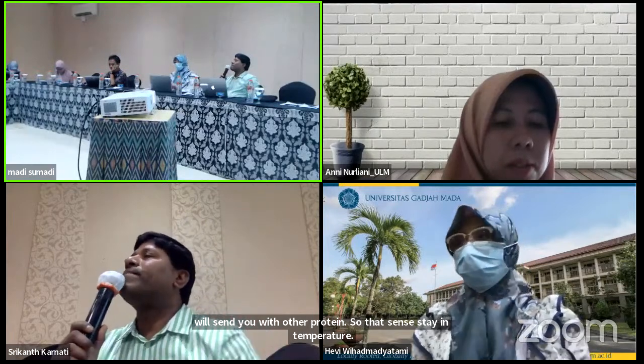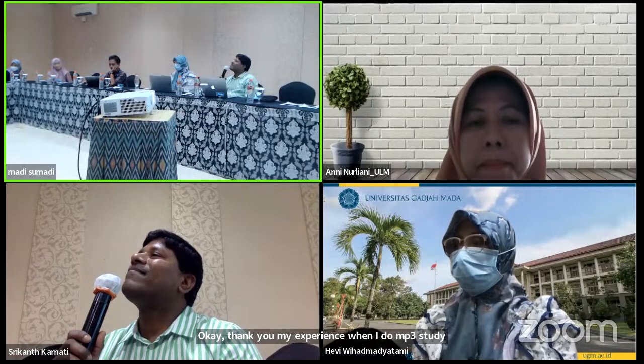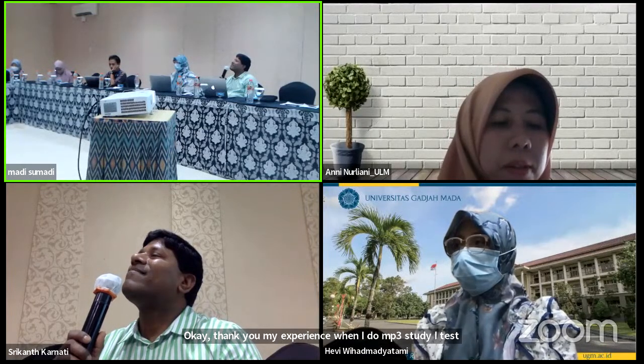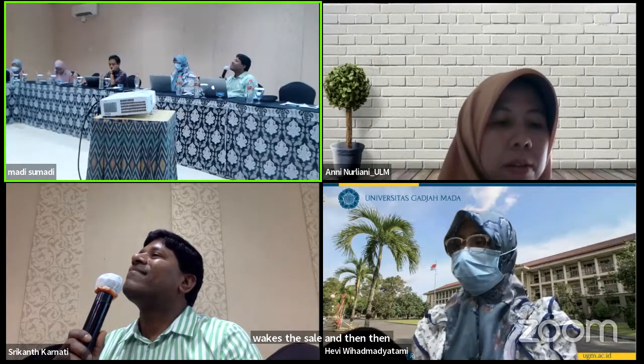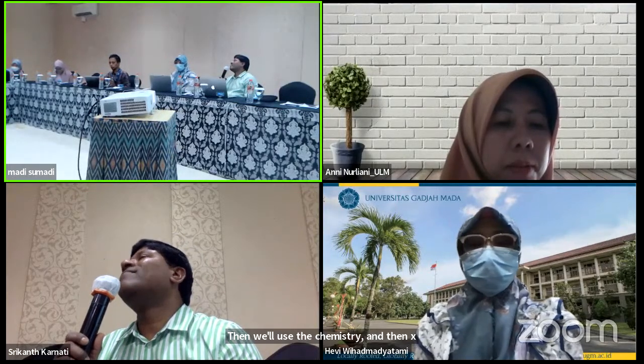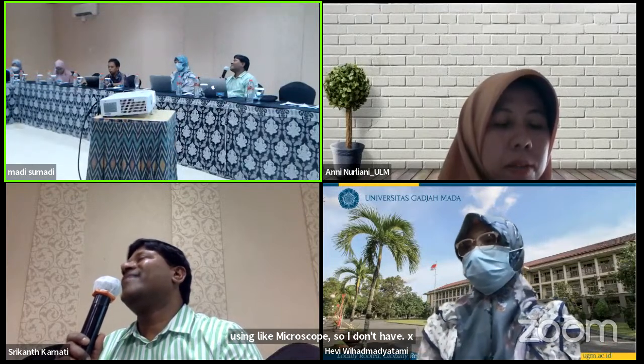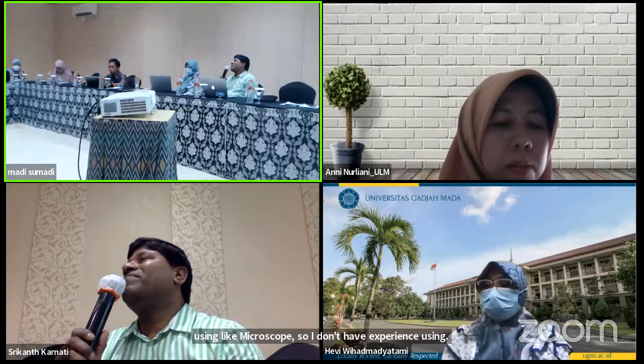My experience when I do in vitro study, I just fix the cells and then stain for immunohistochemistry and then examine using a light microscope. So I don't have experience using them. Yeah. So thank you for the question.